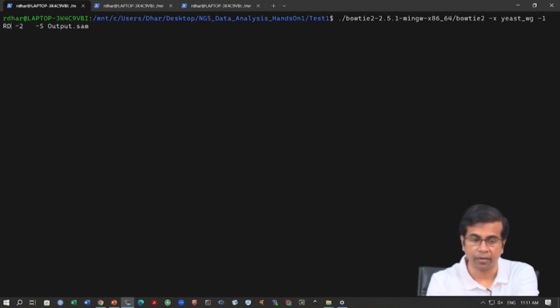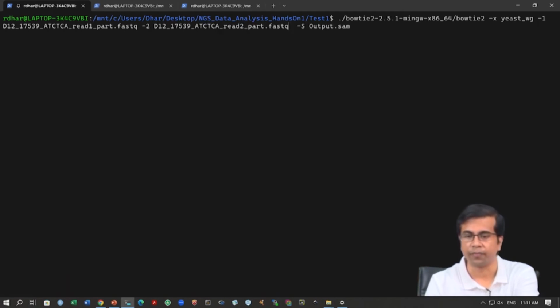So, here, sorry, it is D12. This is the original file, read 1, and then we have the read 2. Okay. So, I have given these original file names now, and we are running Bowtie2 on these original files. So, let us run and see what the output is.